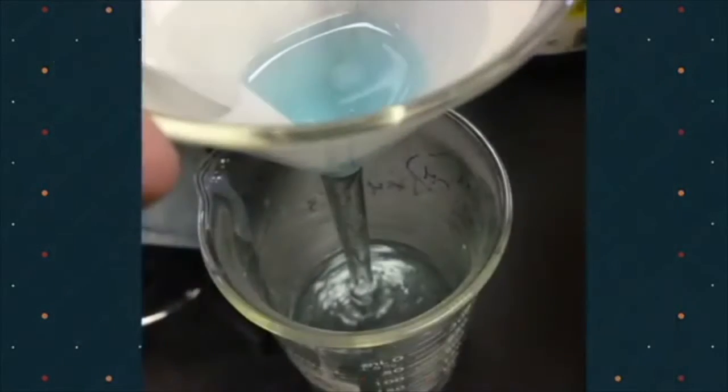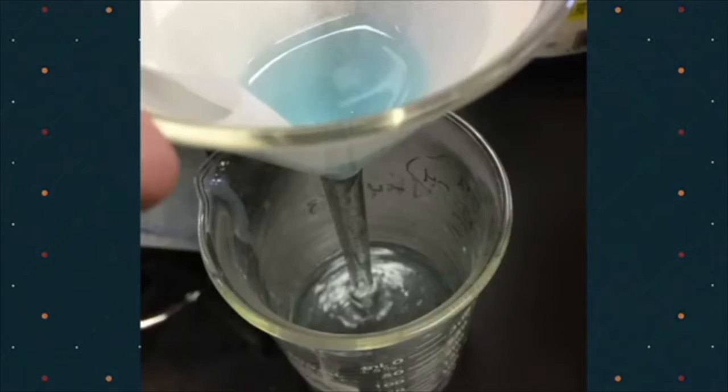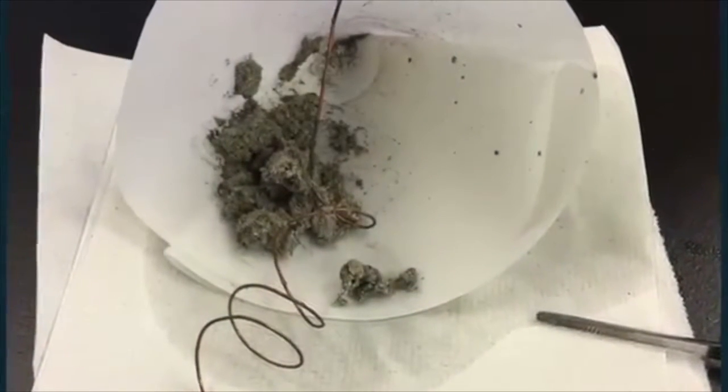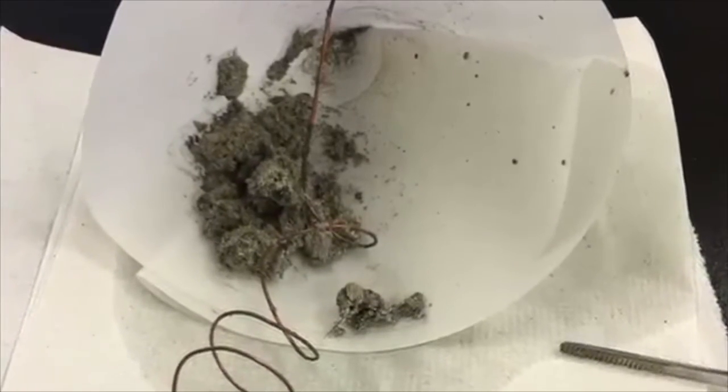To take the silver out, you need to use filter paper and pour the blue liquid and silver into another empty beaker. And this is the end result. The silver that was created is shiny and sparkling. So, how did that happen?